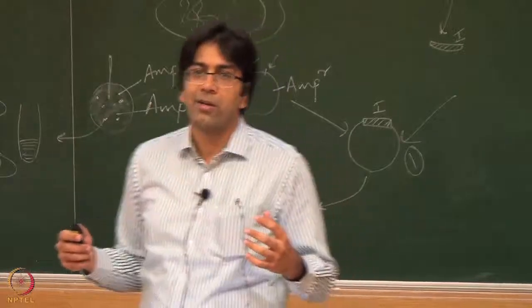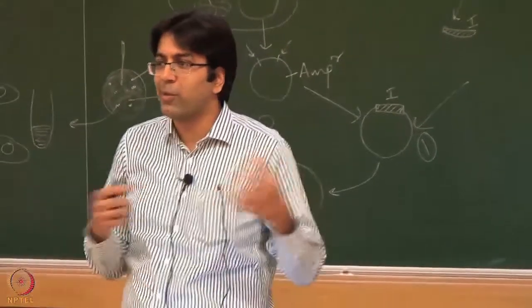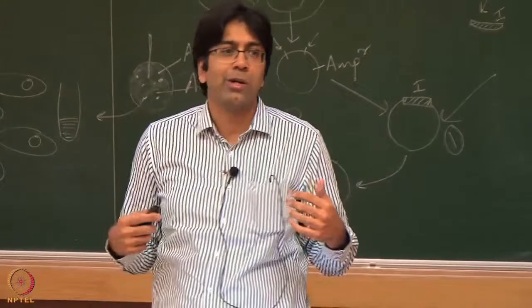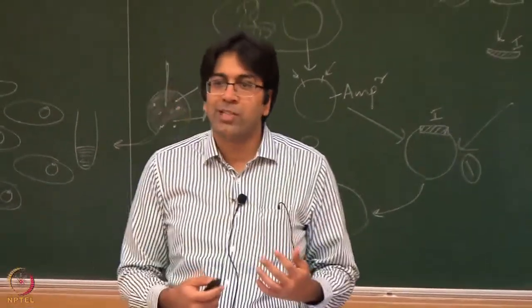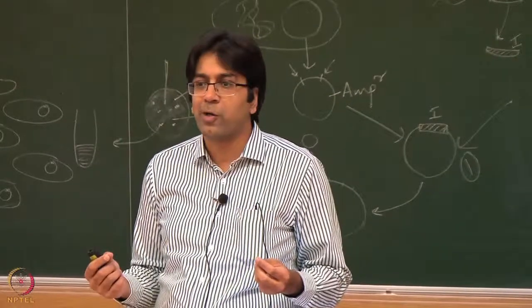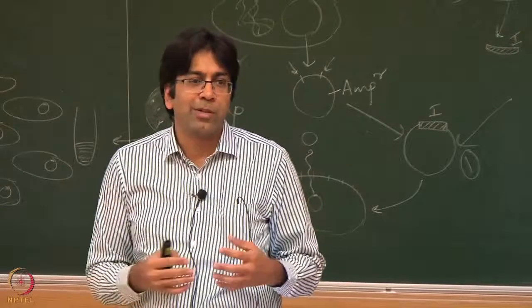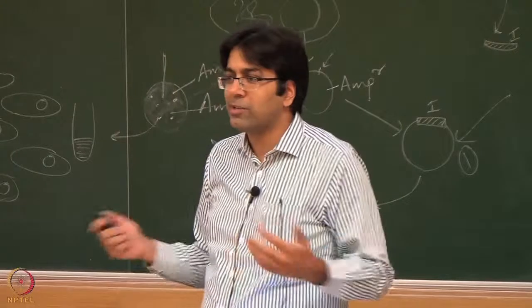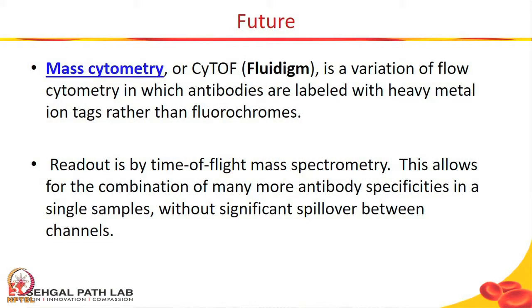Future of cytometry: my personal interest comes from interacting with the proteomics lab for so long. I get to learn a lot, about fields which I have never been exposed to. In the few projects which I have shared, I learned a little bit about mass spectrometry and MALDI. I never knew a word about it. And in the last 5 years I see the field of flow expanding. The latest instrument coming to the market, or in the future, will be a combination of mass spectrometry and flow cytometry.